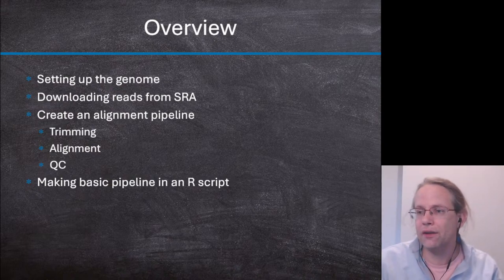The overview for today, very basically, is making a basic pipeline in an R script. And then I think we will spend one more lecture on how you can really make it into a pipeline, so take all the individual parts and make them assembly blocks, so that you can more or less combine them in any way that you want.